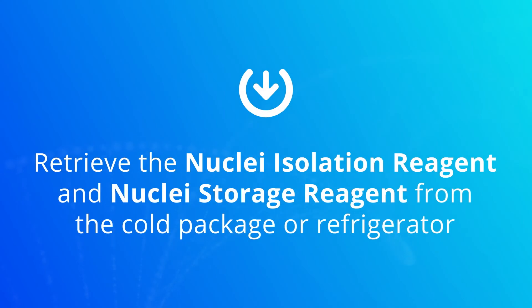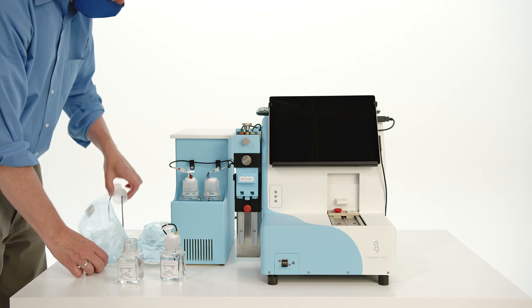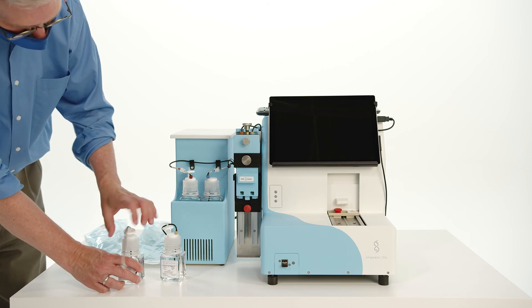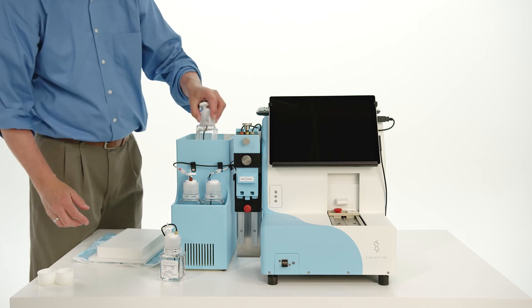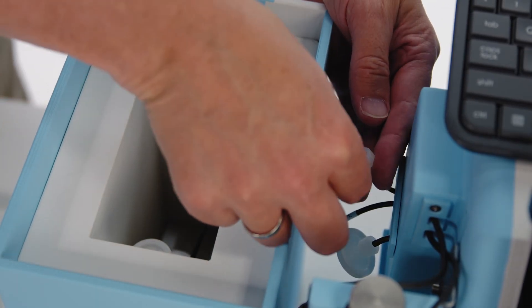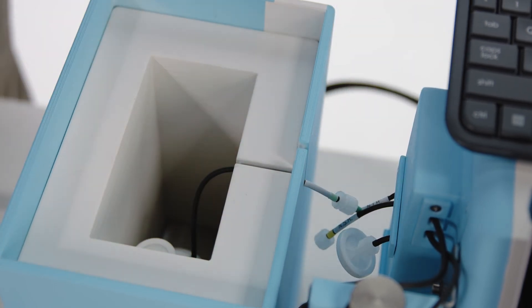Retrieve the nuclei isolation reagent and nuclei storage reagent from the cold package or refrigerator. Find the bottle cap assembly labeled NIR with the green tape, and while wearing gloves to prevent contamination, replace the bottle cap for the NIR with the bottle cap assembly. Remove the lid of the chiller unit and place the bottle of NIR into the chiller. Connect the tubing labeled NIR with the green tape to the bottle cap assembly. There is a slot in the side of the chiller unit — push the black tubing into the slot to prevent it from getting pinched when the chiller lid is replaced.